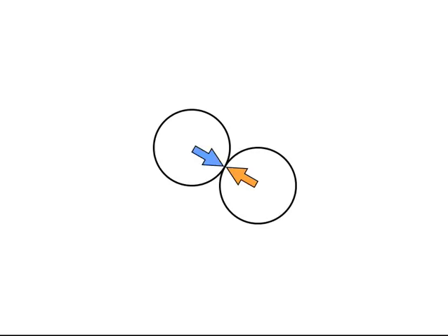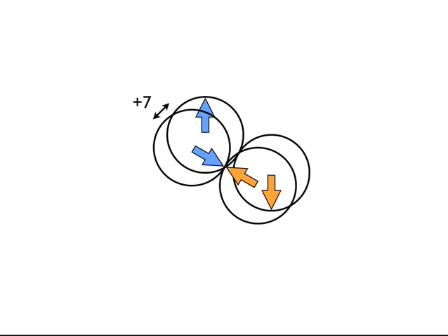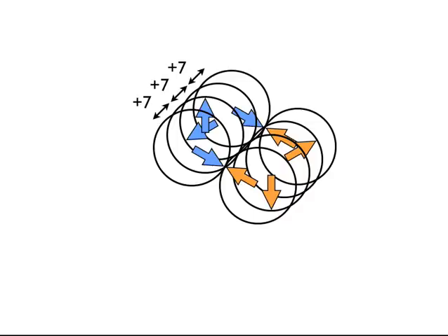Let's take a look at a reduced representation of what I just showed. Again, at position zero, there's a potential crossover between these two helices. If we move seven bases in the positive z direction, we see there are two more potential crossover positions. If we move another seven bases in the positive z direction, we are now 14 bases away from where we started, and we have a third pair of possible crossover positions. Finally, at 21 bases away, we have completed two turns of DNA along each helix, and we're back to an angle where we started.